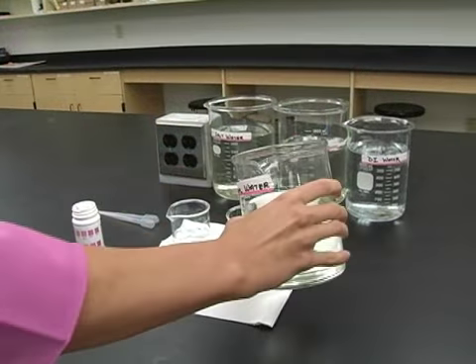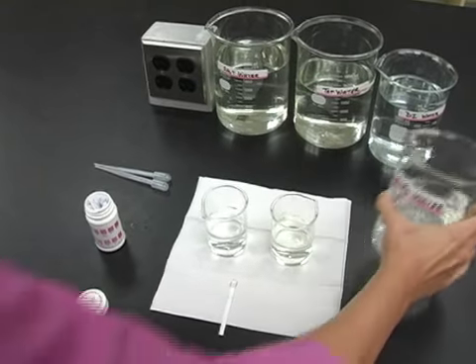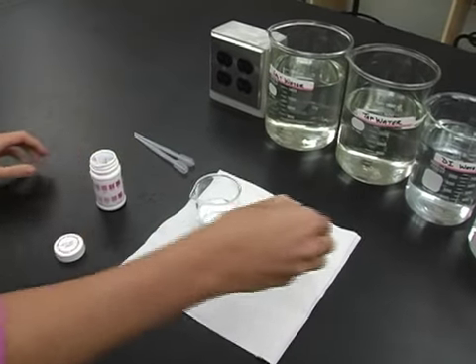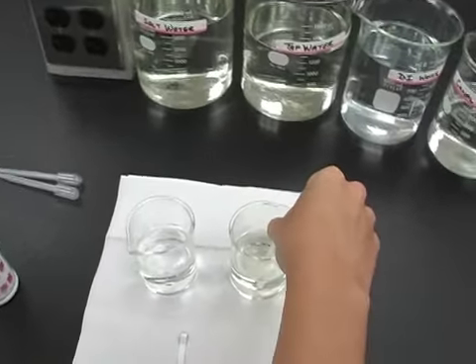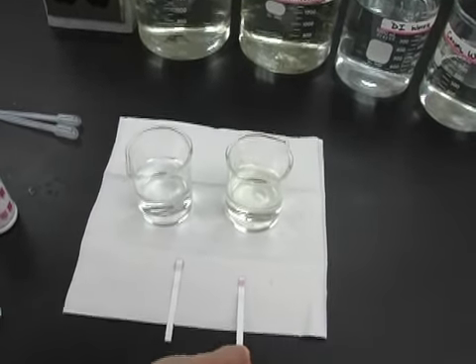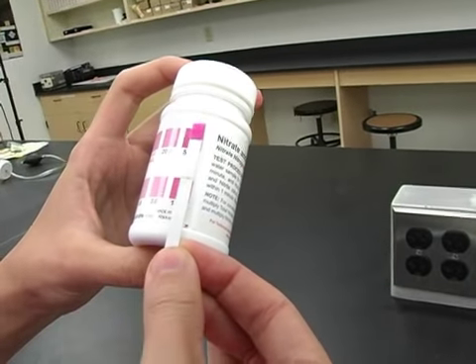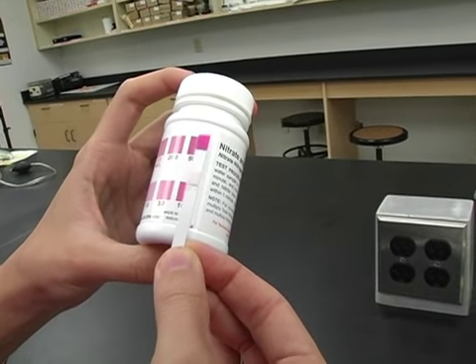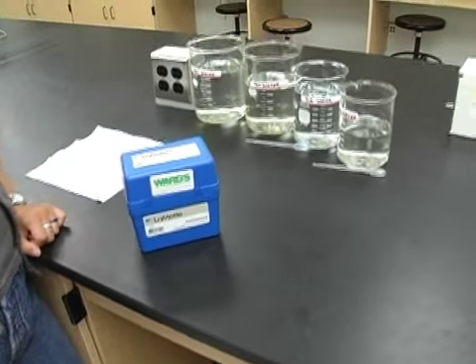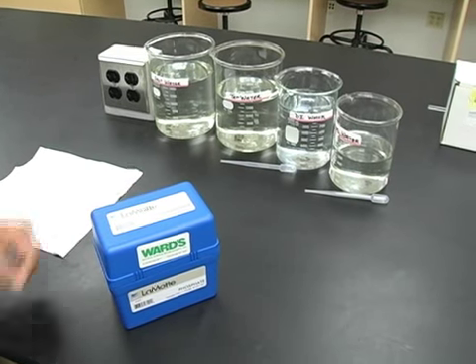The other method is simpler. Here we will use prepared test strips. Take one test strip, being very careful not to touch the test area with your fingers. Dip it into the water sample for 2 seconds. Remove and wait for 1 minute. Then match the test area with the provided chart. Record the ppm.